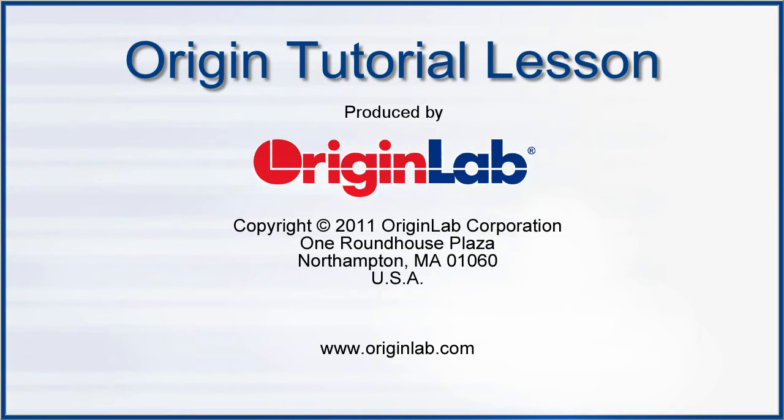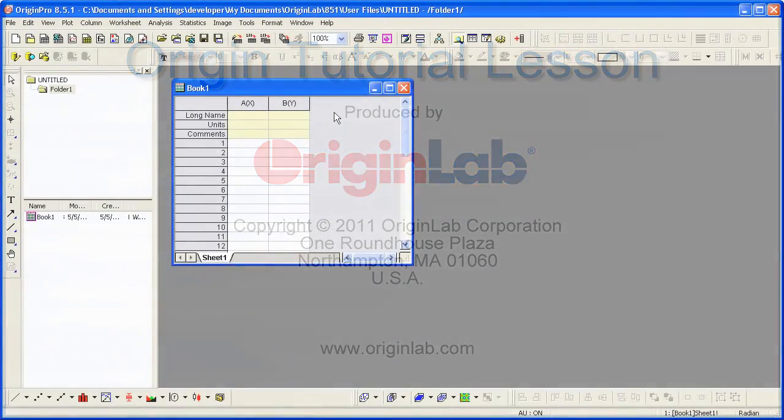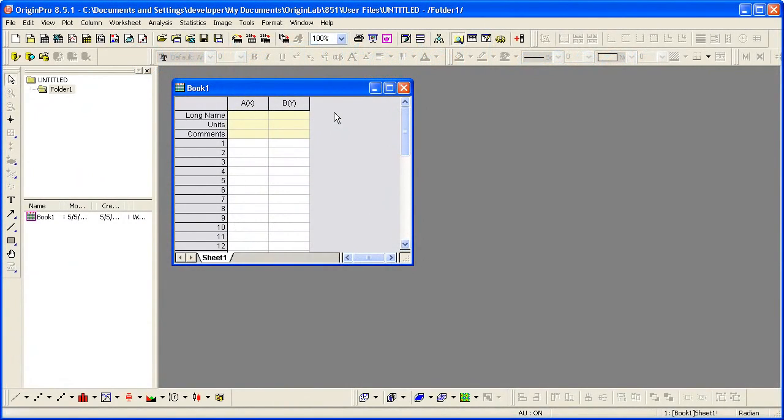This is an introduction to Origin, an easy-to-use data analysis and graphing software used by over 100,000 scientists and engineers worldwide. The Origin workbook is used to organize both your data and your analysis results. The interface has both menus as well as toolbar buttons that provide easy access to tasks.